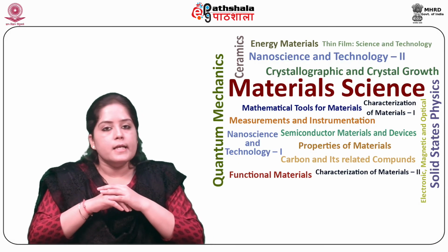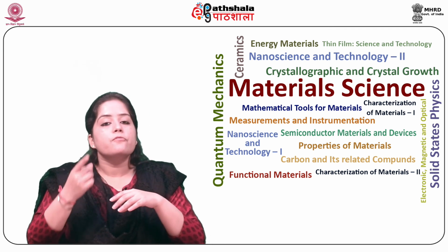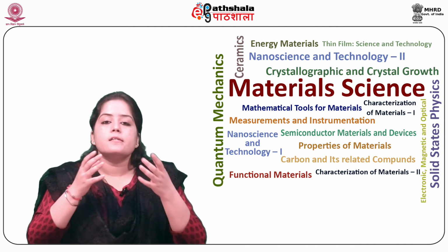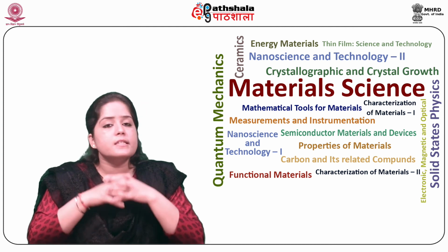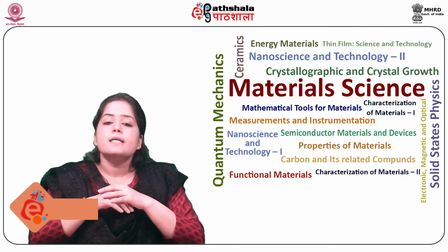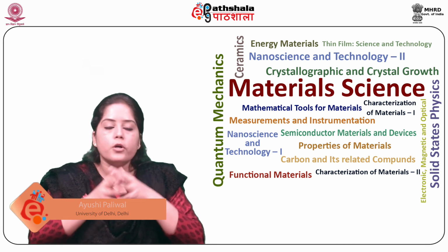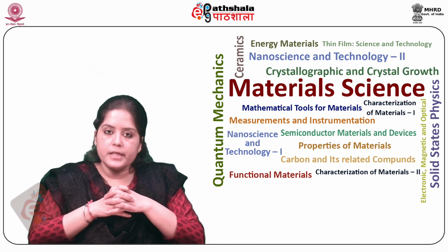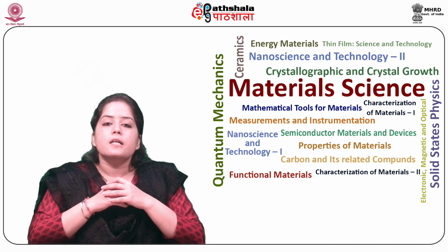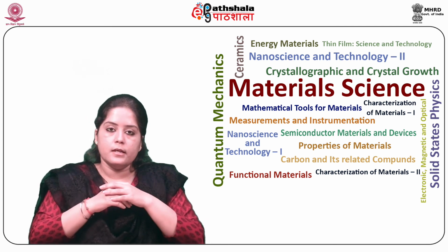So students, let us summarize what we have learnt in this module. First, we discussed the working of the FTIR spectrometer, that is, how it works, along with the detailed description of the Michelson interferometer. Secondly, we discussed the OPD and ZPD, which are very important parameters to study FTIR. Then we discussed the interferogram. Lastly, an introduction about FTIR sampling was discussed. Thank you.